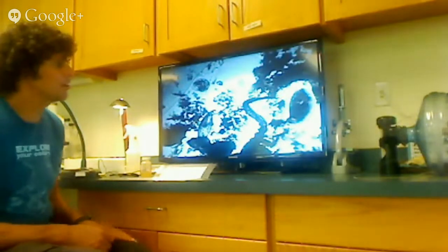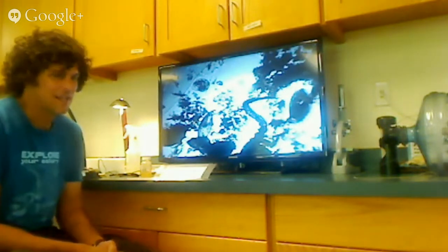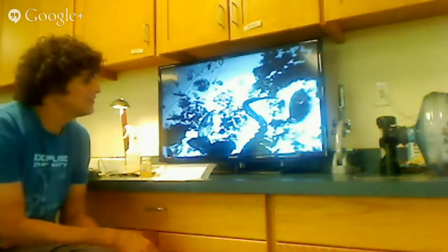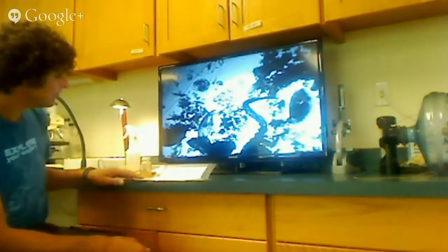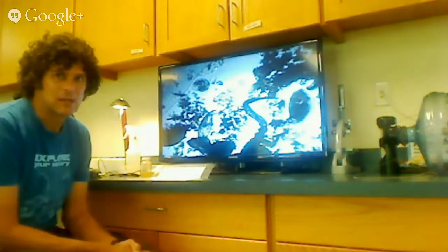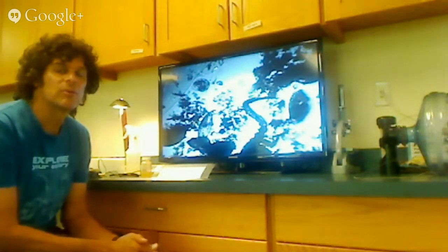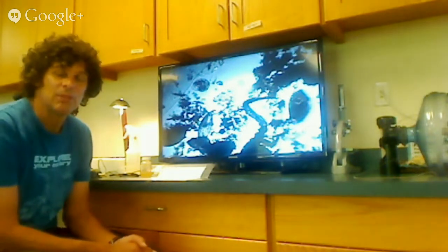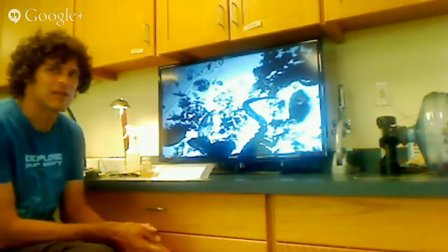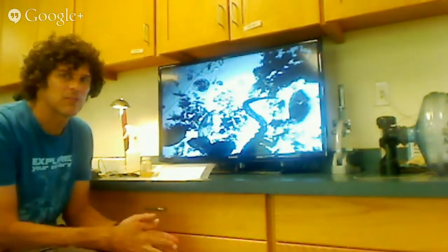All right. So we're here live for a South Slough creature feature test. And the creatures that we're featuring today are animals that live in the estuary, in the waters of the estuary. And these animals are not something that you would notice with the naked eye. So what these creatures are, the creatures we're featuring today, belong to a group of animals and plants called plankton. Plankton means wanderer, and these wanderers of the waters of the estuary and the ocean, and also lakes and rivers and streams, are microscopic. You can't see them with the naked eye.